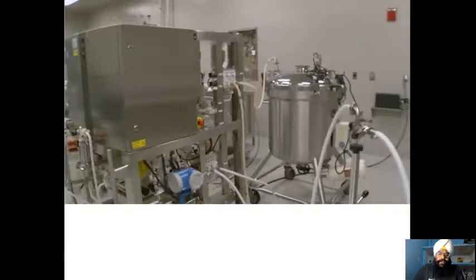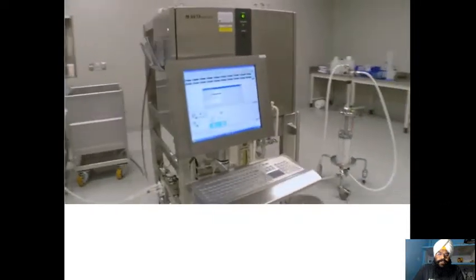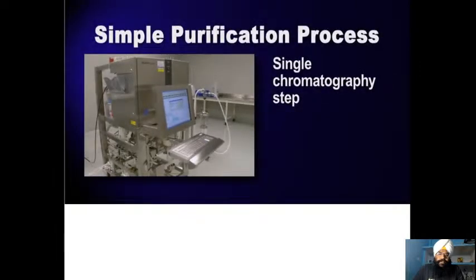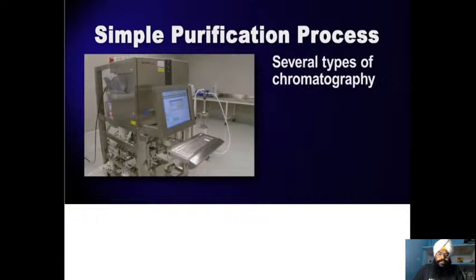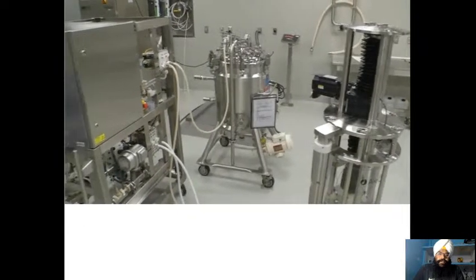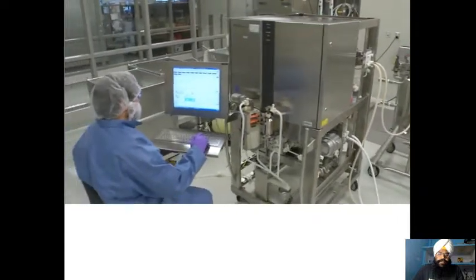From operation to operation, or product to product, the purification process can look quite different. It could be as simple as a single chromatography step, one cycle of TFF to concentrate the product, and final filtration. Or it could involve several different types of chromatography, diafiltration between chromatography steps, and a final conventional filtration. Our green fluorescent protein process is pretty typical of the process for biopharmaceutical products.